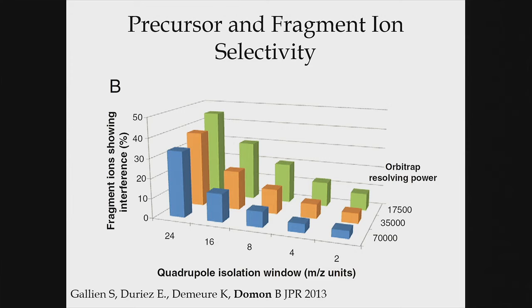So the increases in resolving power is when you follow this box from the back to the front. So in my mind, it's been more important. I've focused more on going on this axis of improving the precursor selectivity. And then, of course, just relying on the instrument vendors to make faster mass analyzers is nice. I've been able to jump from kind of 17.5 to this 35,000.